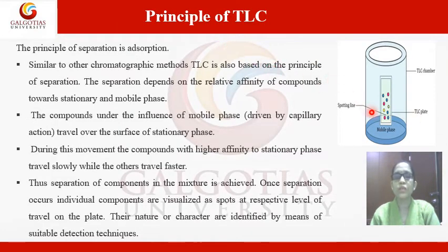Then what is the principle of TLC? The principle of separation here is adsorption. Similar to other chromatography methods, TLC is also based on the principle of separation. This separation depends on the relative affinity of compounds towards the stationary and mobile phase. So how long the stationary phase will adsorb the compound, and what is the affinity of the mobile phase, how fast it will dissolve the compound. On the basis of this, compounds will be separated and move on the TLC plate.